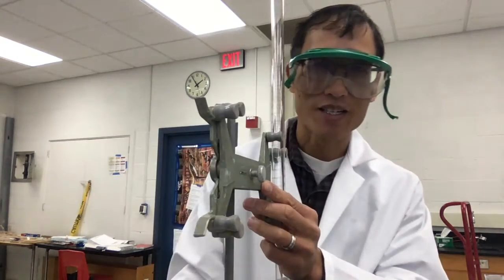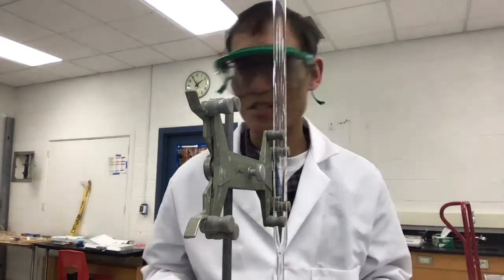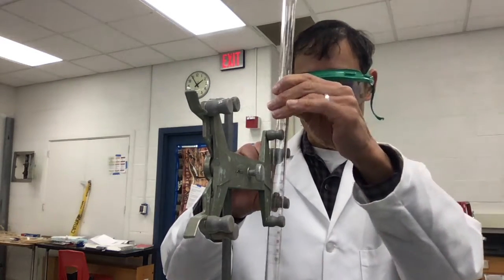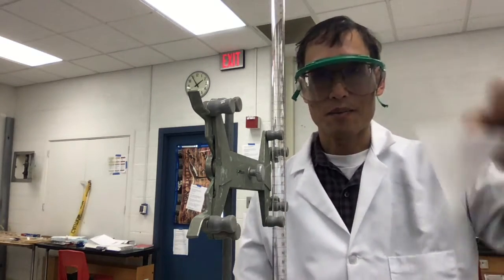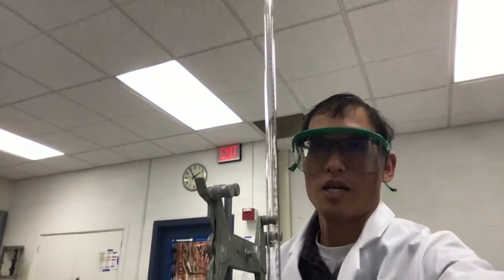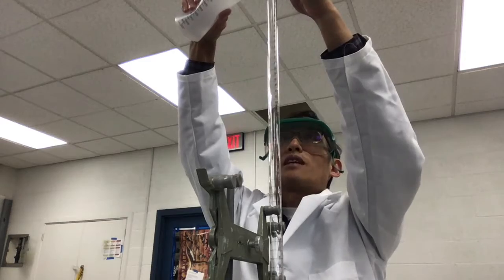I know students find the word stopcock funny, but you can just get it out of your system and then be done with it. So we're going to go ahead, open this up, and rinse it. I'm going to take a funnel, put it here, rinse some water down it, and put a waste beaker down at the bottom, okay?